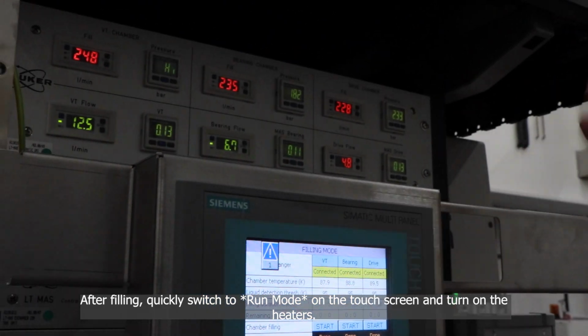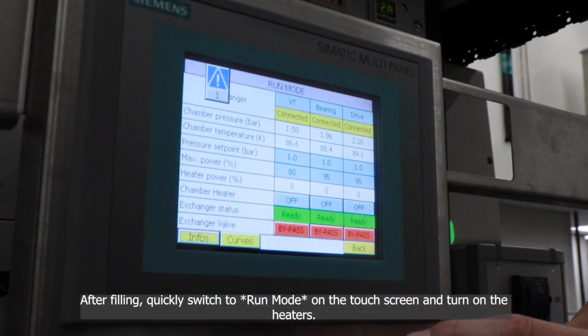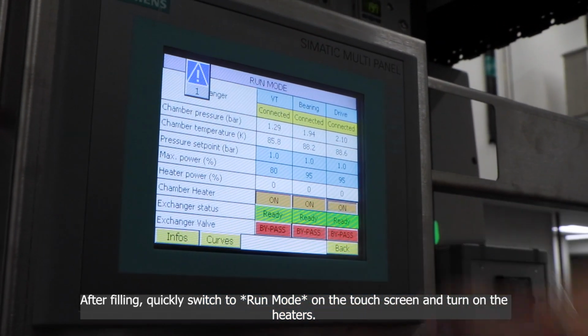After filling, quickly switch to run mode on the touch screen and turn on the heaters by pressing on, on, on.